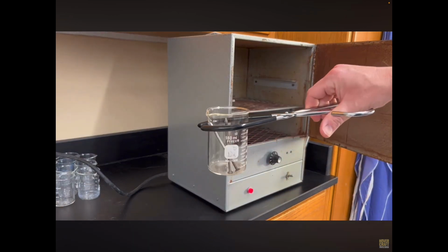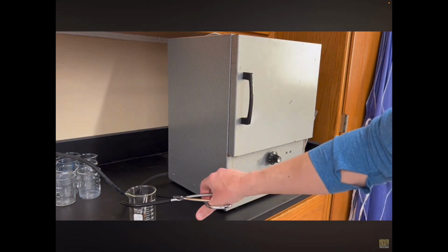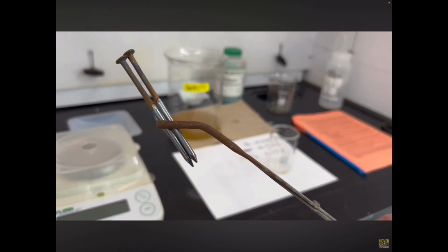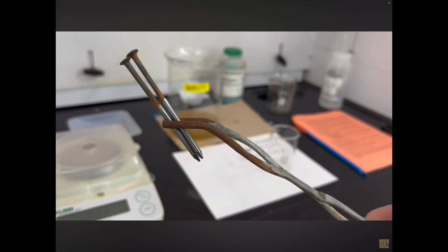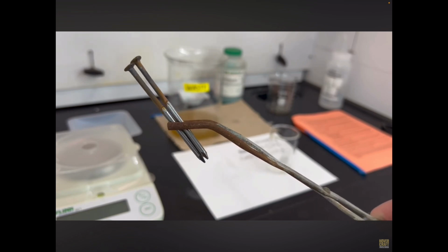Then we can take a look at our iron nails and see how much mass is left on those. Get up a little bit closer. There we go. The nails have clearly been kind of eroded and eaten away. There's a little bit of rusty looking, maybe iron oxide or maybe even some copper that's clinging there. But we want to get a measurement of the mass of those nails and see how that matches our stoichiometric calculations. So that would be a next step.